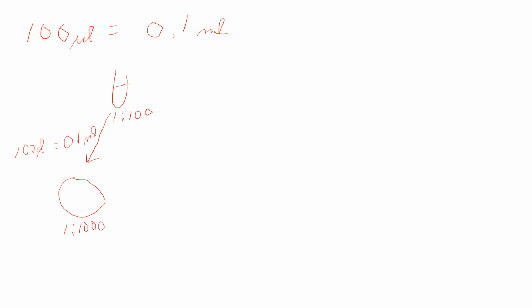And then at the very beginning on page 3, it says using the plate counts from the usable set, that's from page 2, calculate the CFU per mil in the stock. So CFU stands for colony forming units. That is what I know Dr. McClinton tends to use. A lot of people use that. And then a lot of us also use a different term, but it's the same thing. I tend to say how many bacteria per mil. It's the same thing, okay?